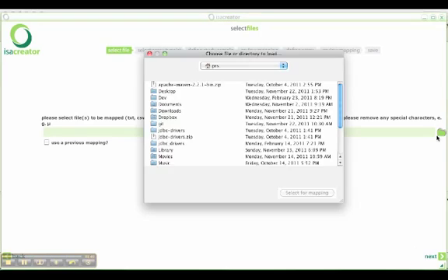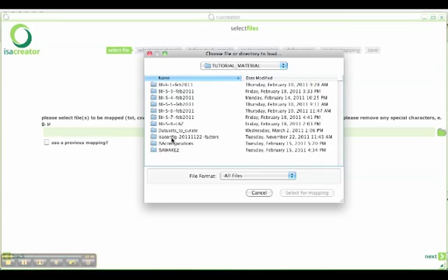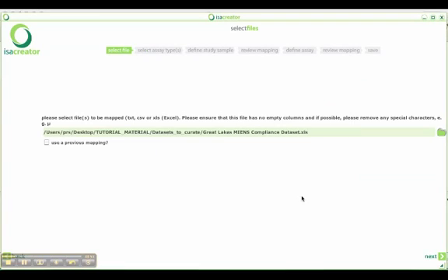We can select the file that we would like to import. So in this example that we're going to use, it's a metagenomic dataset, which comes in a spreadsheet, an Excel spreadsheet. The important thing to remember is that the spreadsheet header should be only one line. So there is possibly some pre-processing to be performed before in order to be compatible with the tool at the moment. Interestingly, we have the ability to reuse the mapping, and the mapping will be saved. So if you have a number of spreadsheets which are similarly formatted, the same mapping could be used more than once and extract information more rapidly.